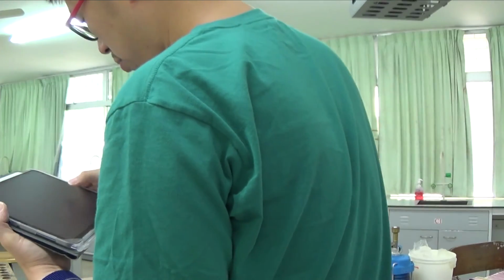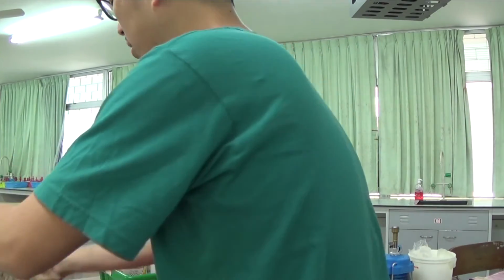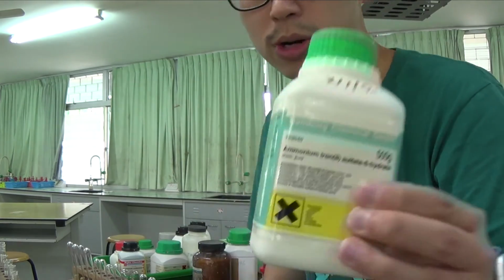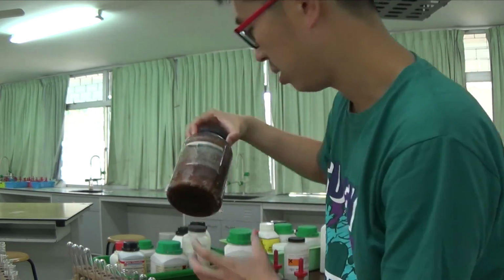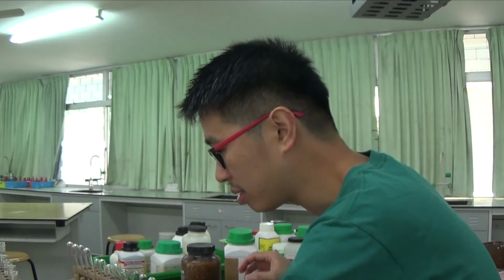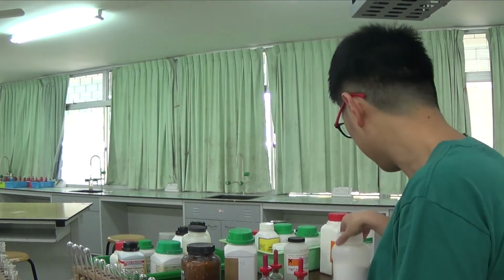Alright, so moving on to the next bit, the next tutorial that I'll show you is to do with one of these double salts. It's also a double salt, but I'll spend the rest of this tutorial focusing on ammonium iron(II) sulfate as well as ammonium iron(III) sulfate. I am testing for ammonium, so I must make sure that I have enough red litmus paper. Alright, so let's get started.